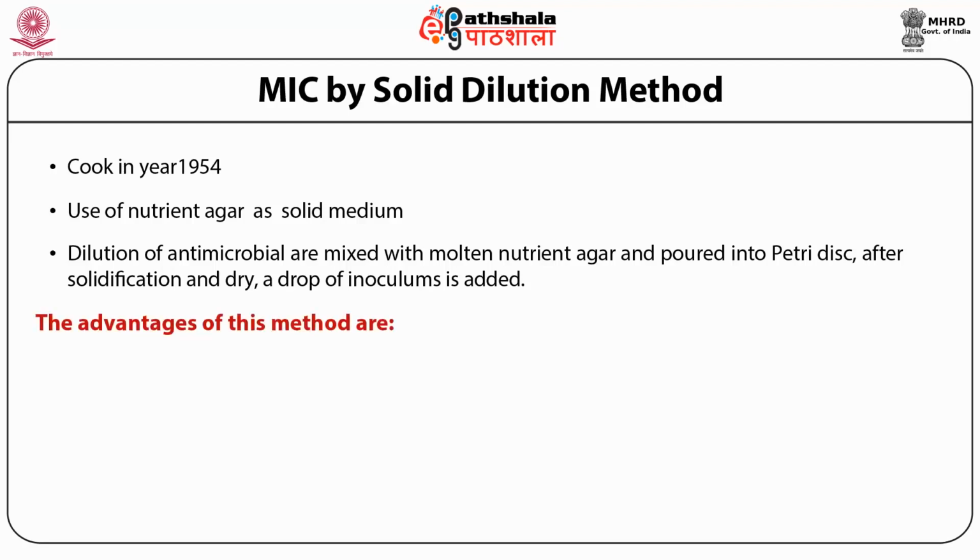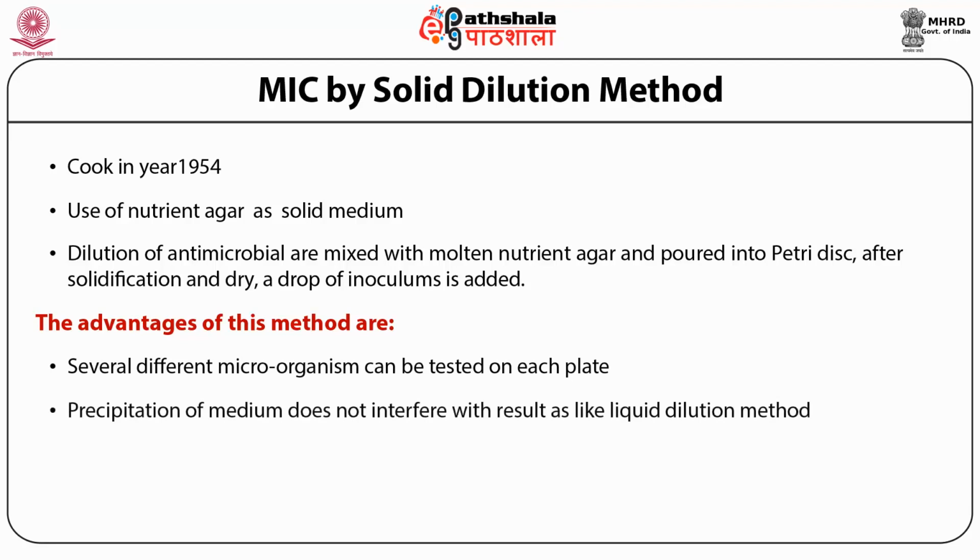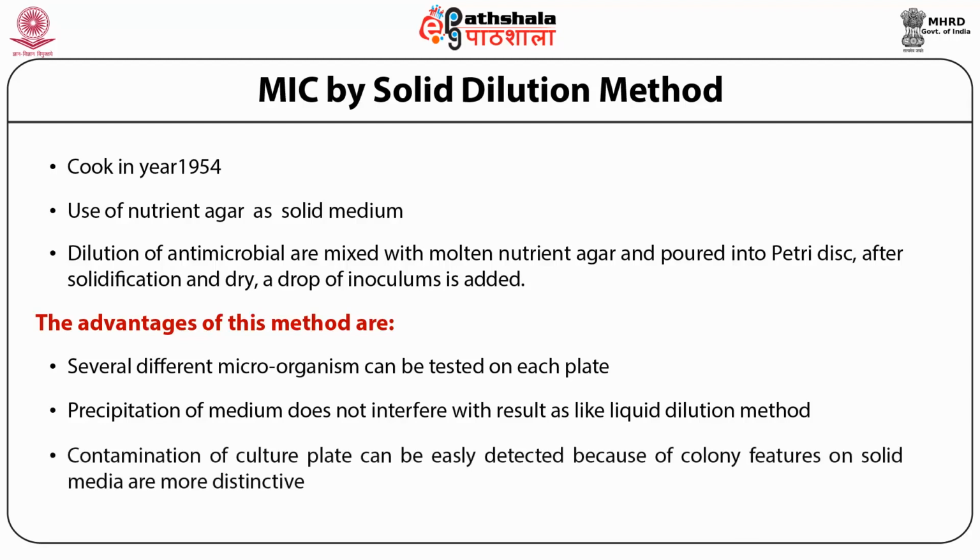The advantages of this method are that several different microorganisms can be tested on each plate. Precipitation of the medium does not interfere with the result, unlike the liquid dilution method. Contamination of a culture plate can be easily detected because colony features on solid media are more distinctive.